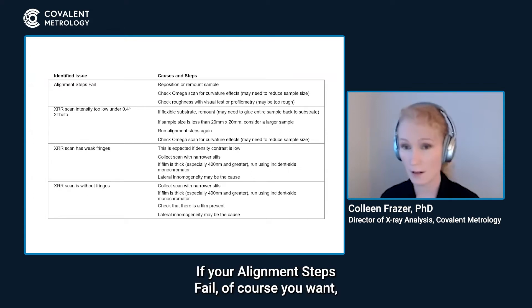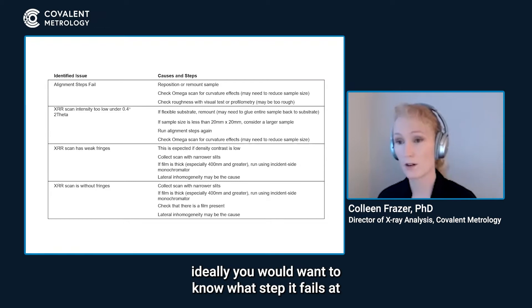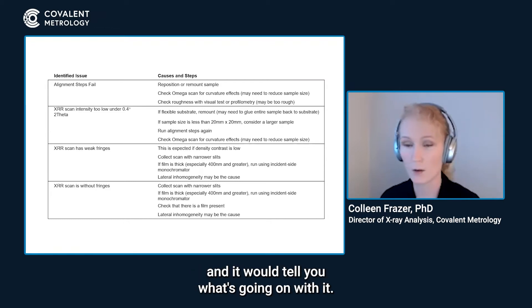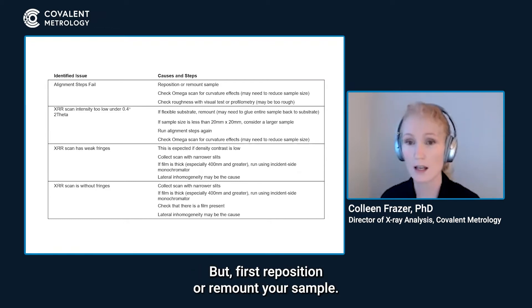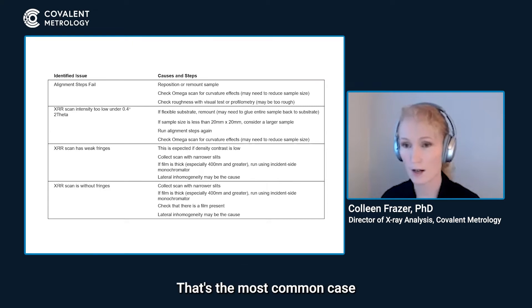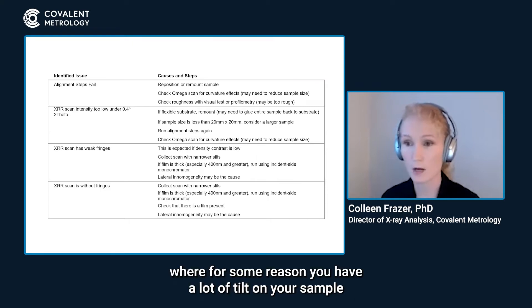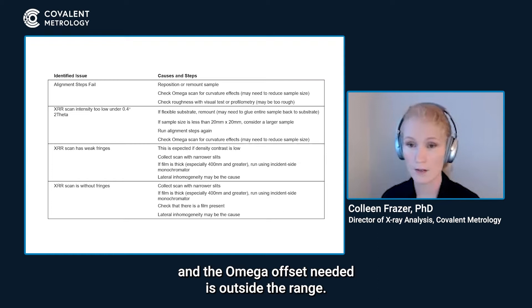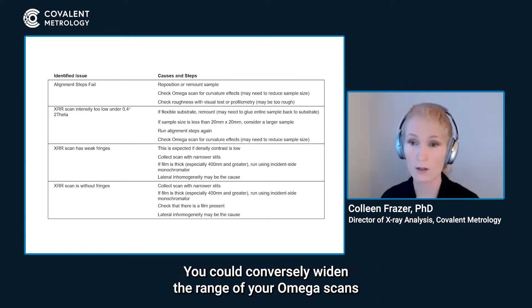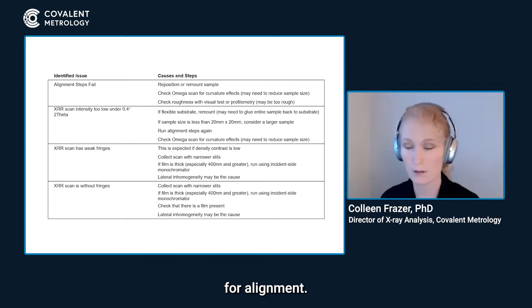If your alignment steps fail, ideally you would want to know what step it fails at and it would tell you what's going on. First, reposition and remount your sample. That's the most common case where you have a lot of tilt on your sample and the omega offset needed is outside the range. You could also widen the range of your omega scans for alignment.